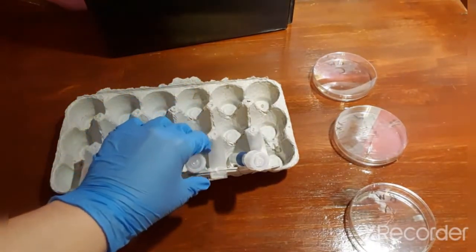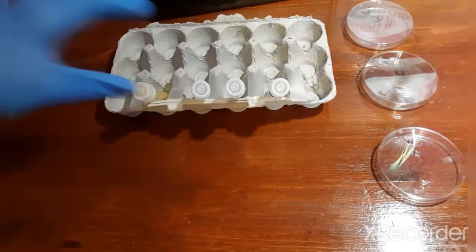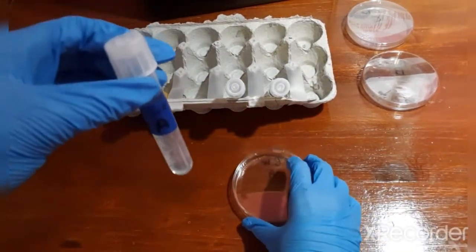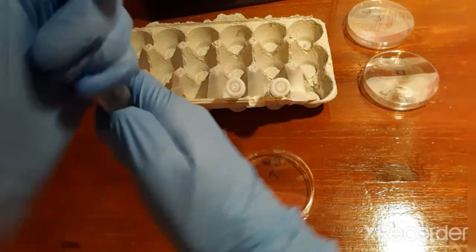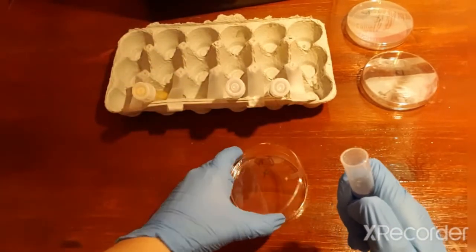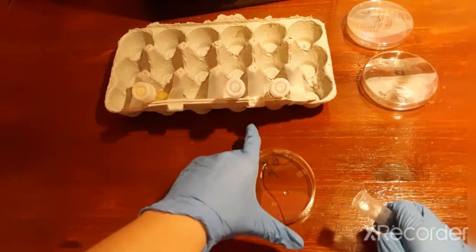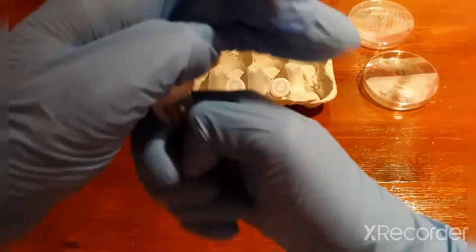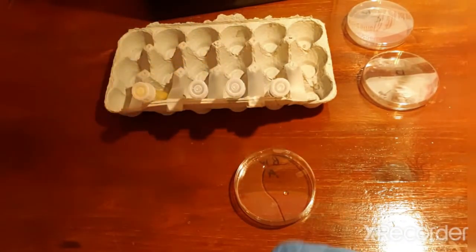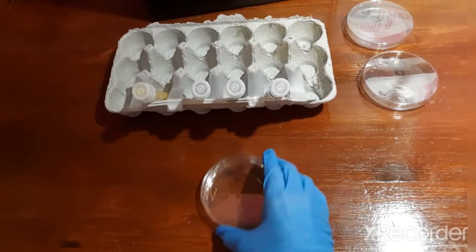Put B back down and incinerate your loop to sterilize it. Now you're going to pour the contents from test tube A into the petri dish labeled A. Put the lid back on, put the cap back on, then place test tube A back in the test tube rack. Once you've done that, gently swirl the agar until the entire bottom of the plate is covered in the mixture.